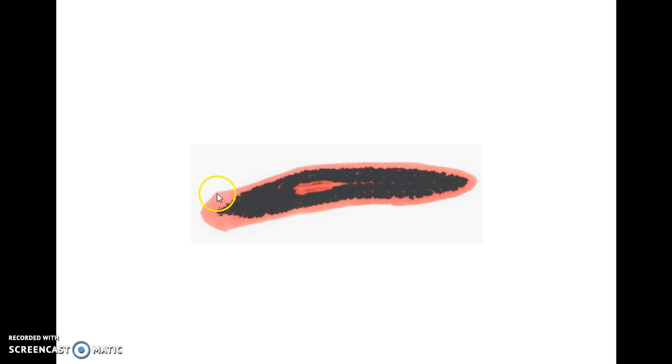They live in the water. They have very primitive eyes right there and right there. They're not eyeballs. They're what are called eye spots, and this creature can essentially just tell the difference between light and dark, where there are shadows, maybe the shadow of a predator that's trying to catch it. But they can't really see in the true sense of vision, but they can detect the difference between light and dark. We have a very primitive stomach over here.